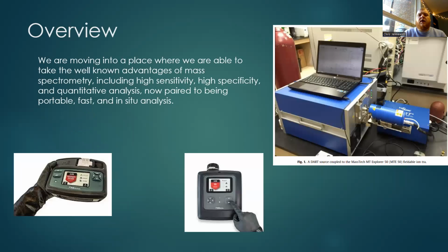So the overview. We're actually at the place now where we're able to take this relatively large and bulky instrument and take it into the field while still maintaining our broad stroke key statements of what mass spec is: being highly selective, highly sensitive, and providing a real quantitative analysis, right?